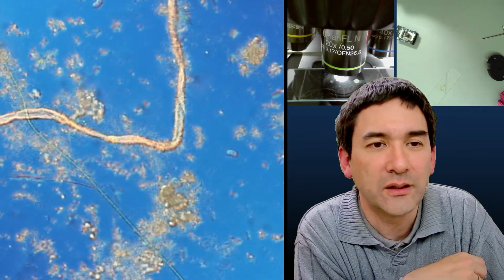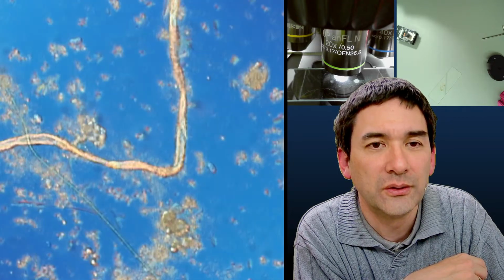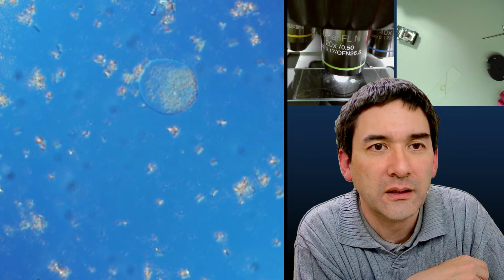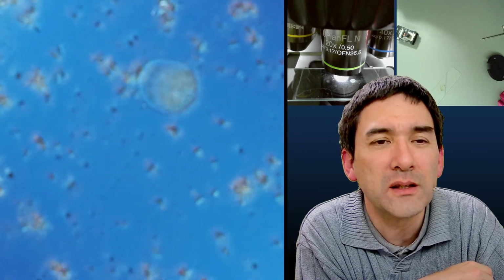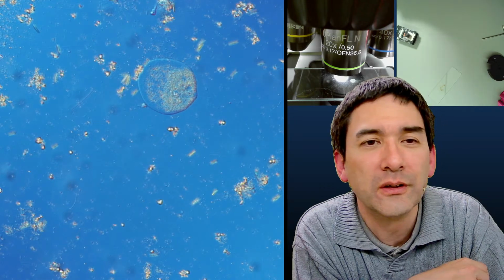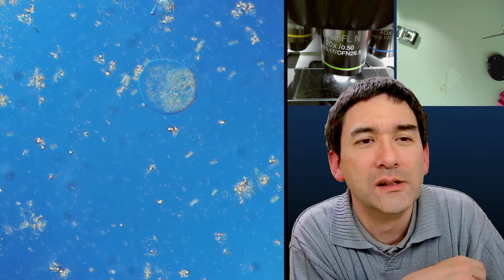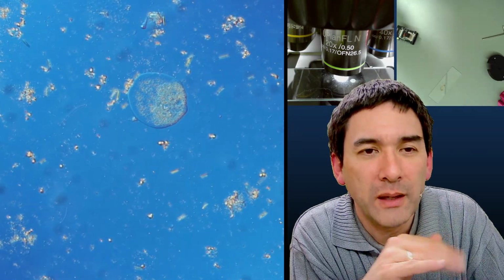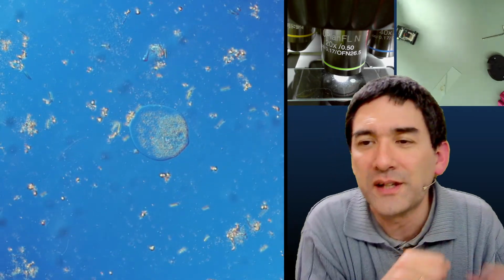Yeah. Or them just, here's, I don't know. Not a lot. Yeah. There were plenty of paramecia. Look at this. Could it be maybe that some of them are already squashed? It looks pretty squashed here. I think because the water sample has been drying out now, many of the microbes have already been compressed a little bit. Okay.